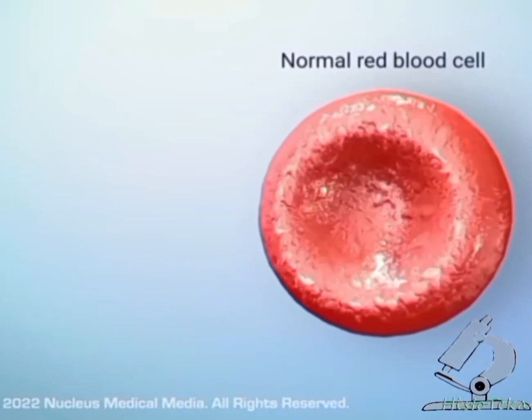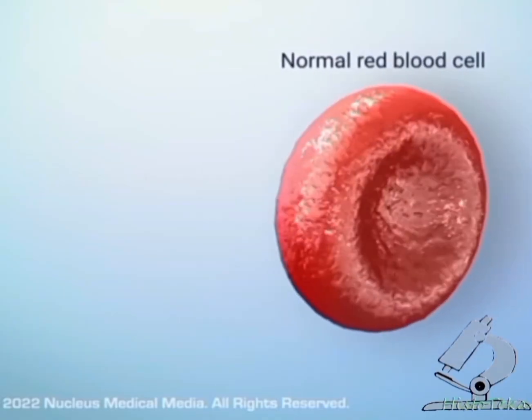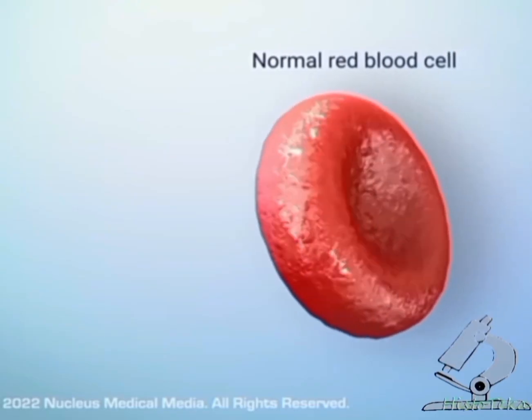By the way, red blood cells are not cells, but post-cellular structures, because, as I said earlier, they have neither nuclei nor organelles.